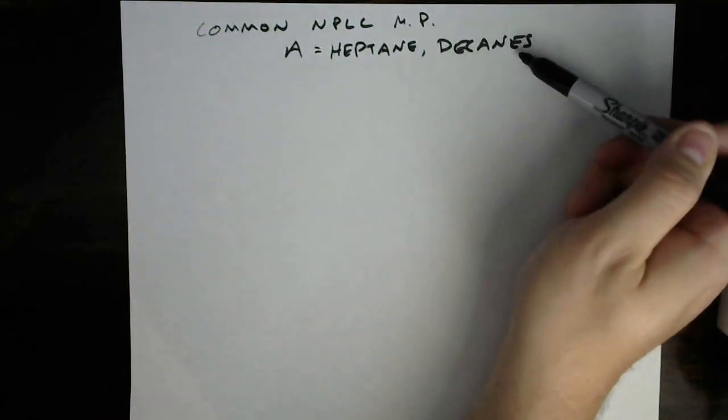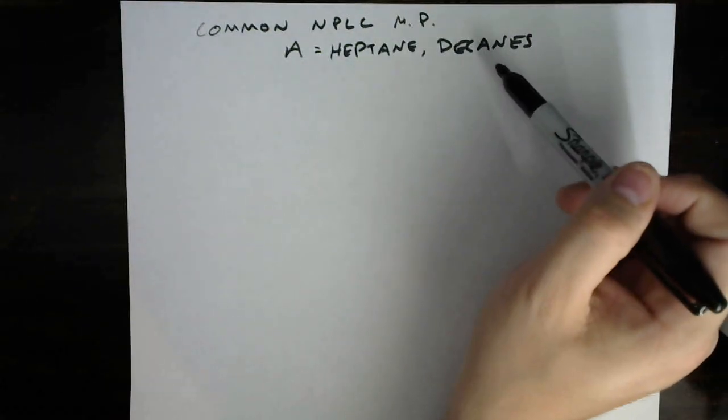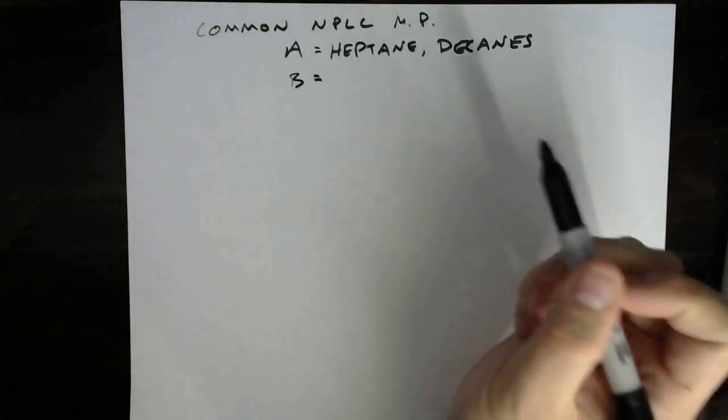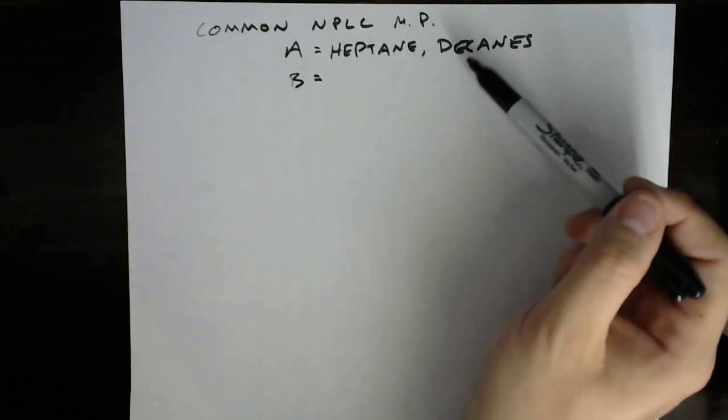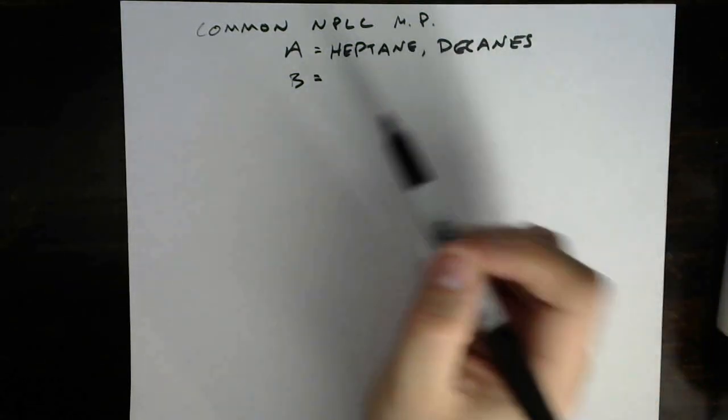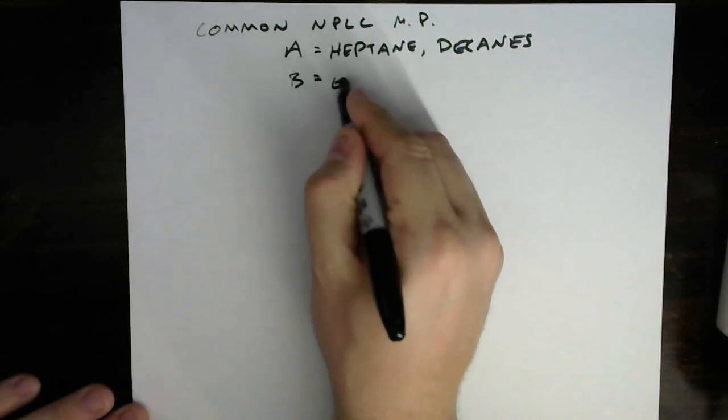As we're increasing %B, we're trying to get more polar. So let's think about organic solvents that are going to have some polar character. They need to be miscible with these highly nonpolar solvents, right? So it's a tricky requirement, and we will certainly not get to a point where something is as polar as H2O because those will never be miscible with heptane or decane. And so what's really common here are ethers.